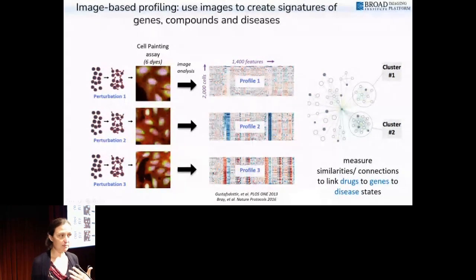We also use deep learning to extract features directly from the raw pixels of images. From our lab's experience and from what other groups tell me, you can usually perform tasks more powerfully if you use deep learning for feature extraction, especially if it's supervised or self-supervised in some way. But it's often not dramatically better, maybe 10 or 20 or 30% better.